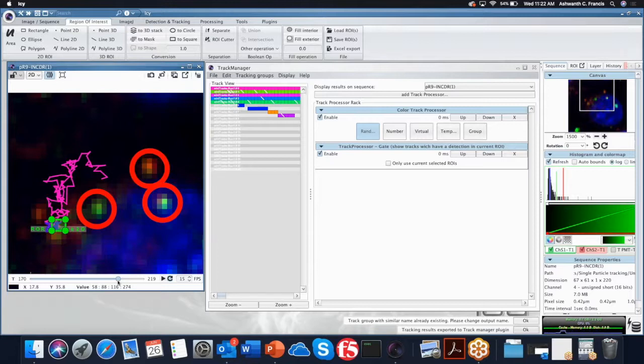Okay. So what I do now is I draw a second region of interest on this particle over here. And you will see a second track appearing for the second segment of the particle tracks. See that? Okay. Have you guys identified these type of tracks?